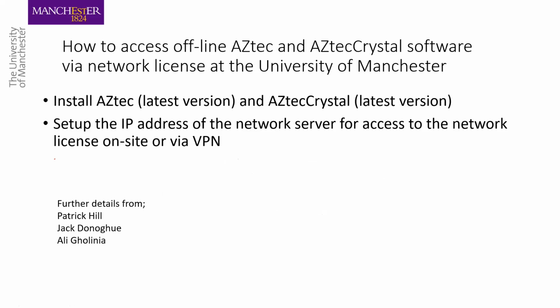So finally, before handing it to Jack, I want to say that if you want to access the AZtec and AZtec Crystal offline, it's possible. You have to install the latest version and set up the IP address for the network server at Manchester. And if you want further details, get in touch with Patrick Hill, Jack, or myself.